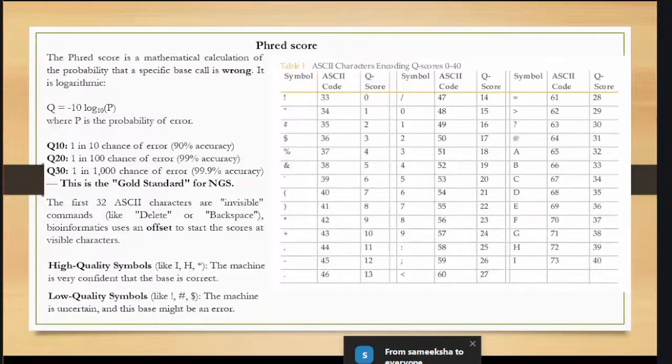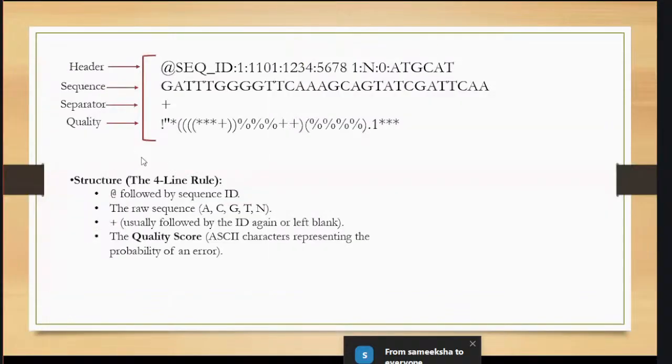Maybe we can give a command to exclude the symbols and exclamatory marks, so only the sequences remain at the end. Then you will get all the lines with the sequences, and you have no identifier to understand how many reads are in the FASTQ.